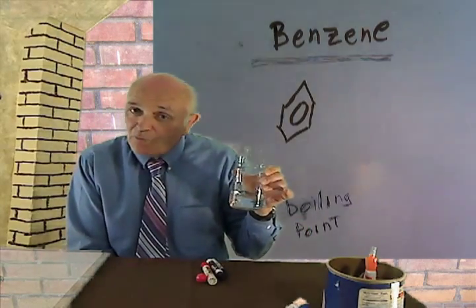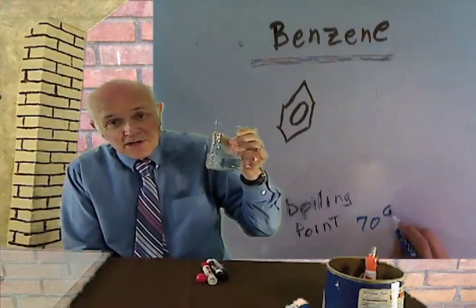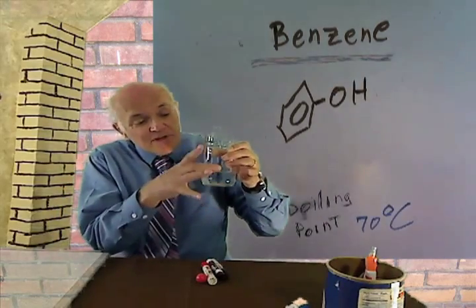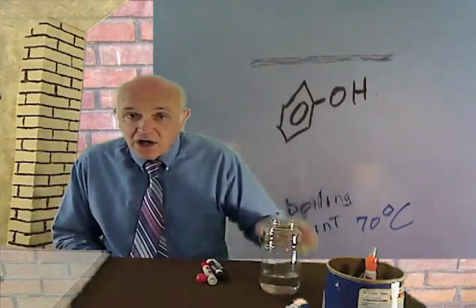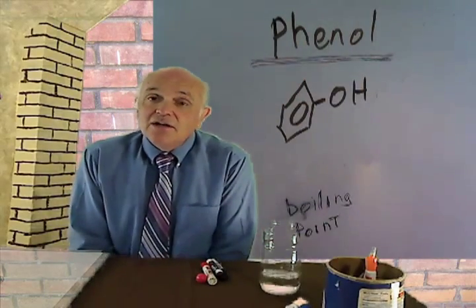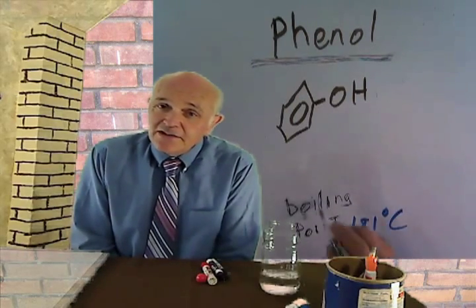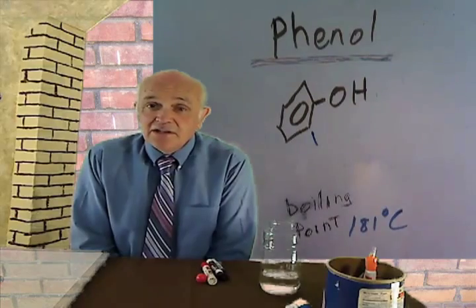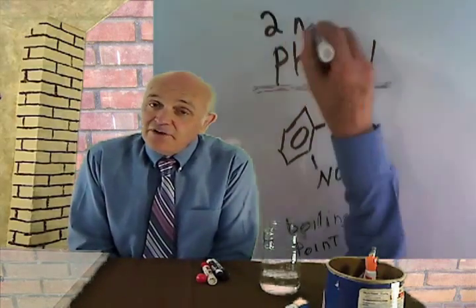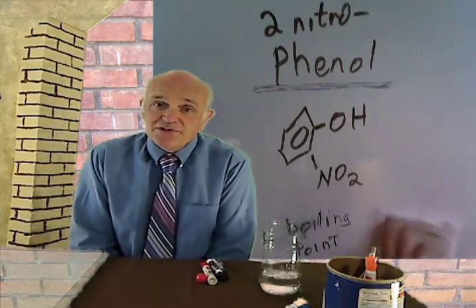So a simple guess would be that if you took the methylene chloride, which has a boiling point of about 40, and heated it up to 40, the methylene chloride would come to a gentle bubble, bubble, bubble, and the methylene chloride would boil off, leaving behind everything else. The way it's done in real life is not real different than that. You essentially boil it gently. The methylene chloride very quickly boils off, and the other materials don't.